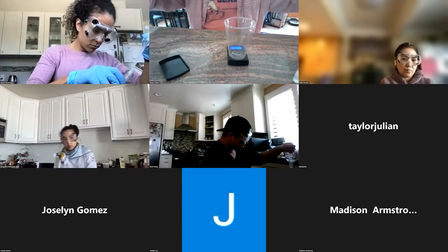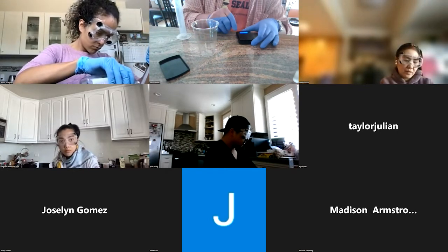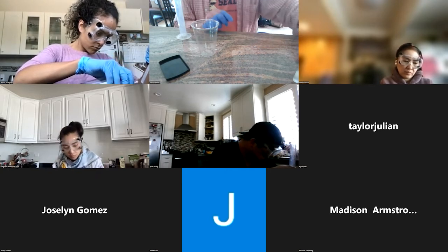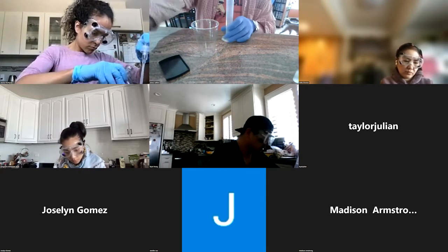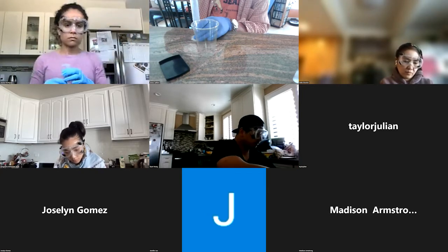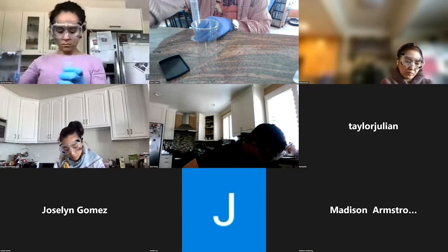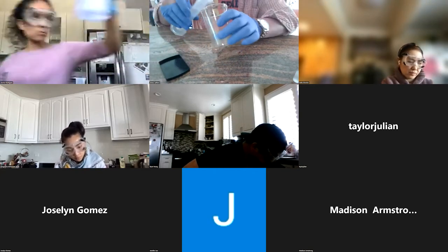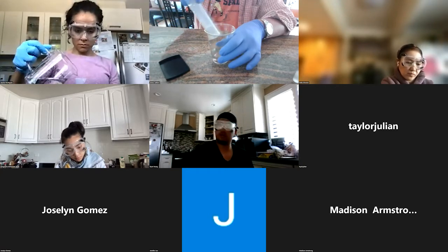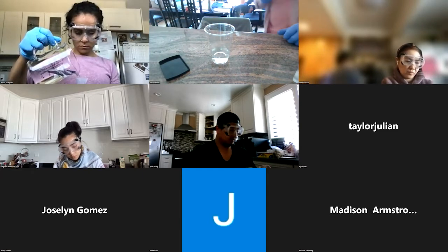And 50 mils of water. Got my purified water here. And then get my spoon to mix it up.